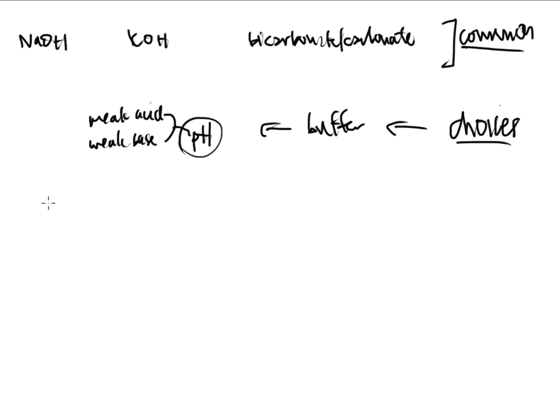And in a previous video, I told you that in one case we can use acetic acid. But acetic acid is a weak acid. And it gives off a proton, but it doesn't give off all the protons, right? Okay, well, this is a weak acid choice, and the complementary weak base choice would be, well, what would this be after it gives off the proton? Well, that's CH3COO minus.